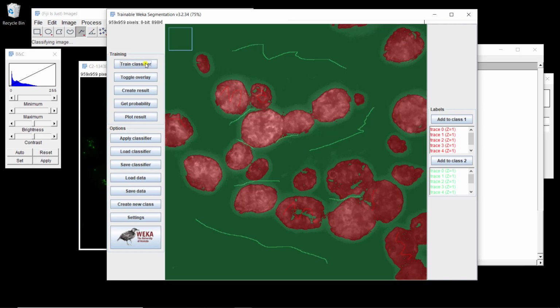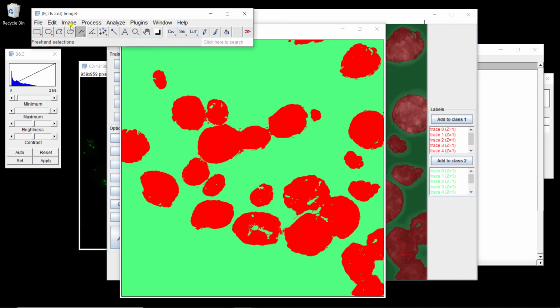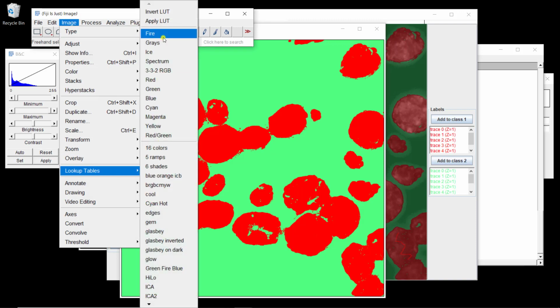All right. Now let's see if we take this result and, with some mathematical morphology, can we get a good segmentation? I think we can try now. Maybe we could add a little bit more, but let's try it. If it doesn't work, we will go back to it. So I can create a result, and I'm going to put it in gray levels. I don't really like to use this kind of colors.